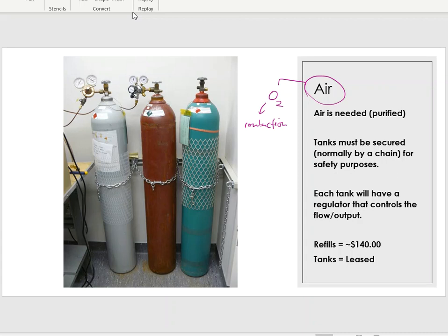If you've taken our safety course, you know that any time tanks are sitting out in a laboratory they need to be secured. You must chain the tanks up to a wall railing so they can't turn over and fall — which could cause an explosion. We chain them down not because they'll walk away, but simply to prevent accidents.